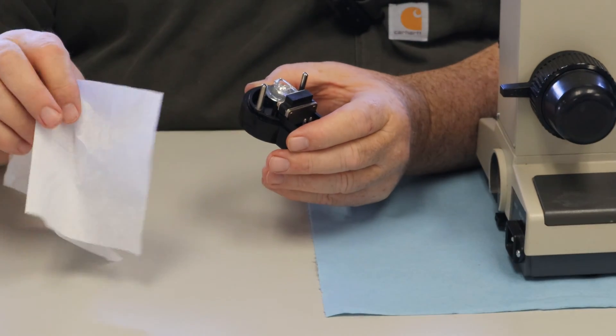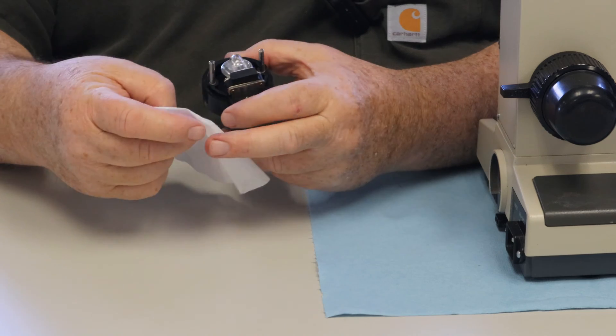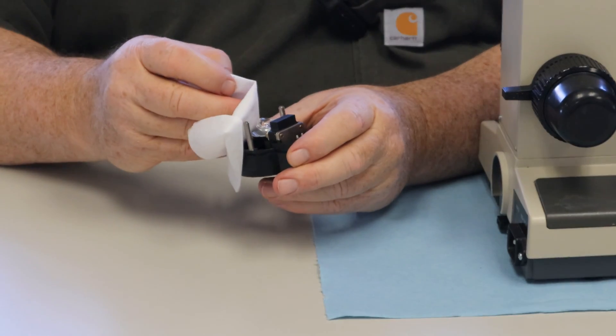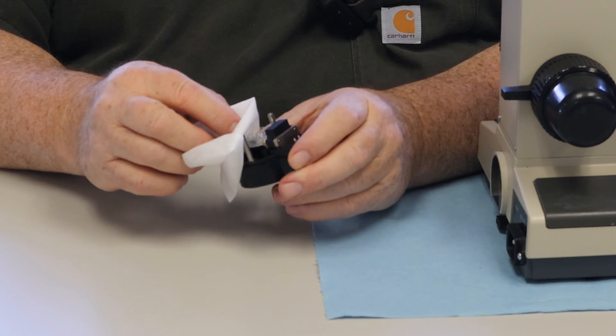Get a kim wipe or tissue of some sort. If you leave oily fingerprints on the bulb, it will burn into the bulb.